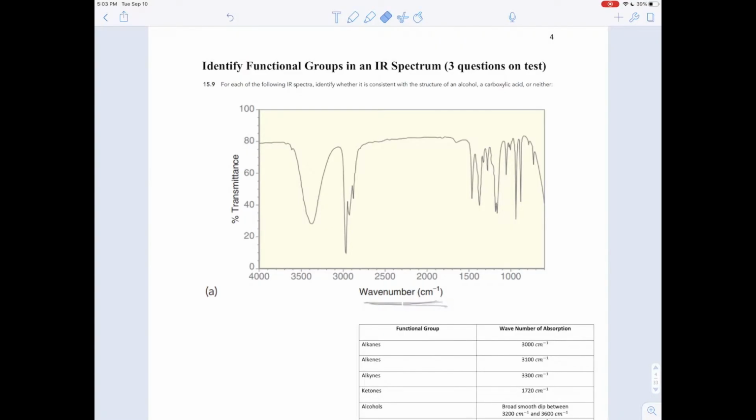So we've got on the x-axis this spectrum, different energies of light that we've shined onto a sample. And on the y-axis we have transmittance, percent transmittance. How much light got through? I'm sorry, at 100%, all the light would get through. It's 100% transmittance. Everything is transmitted through the sample.